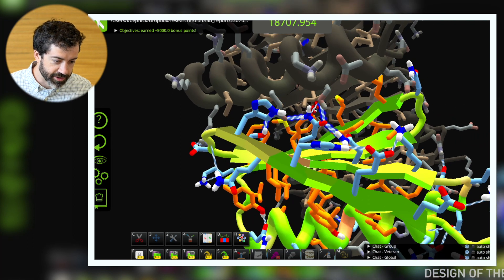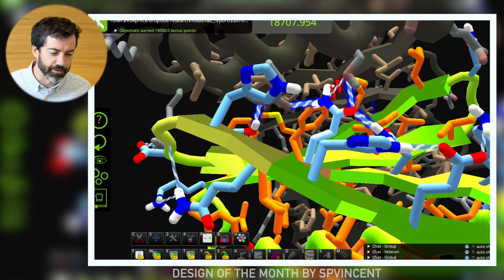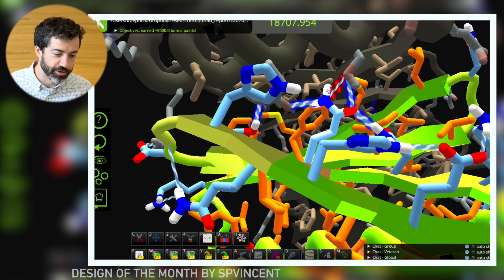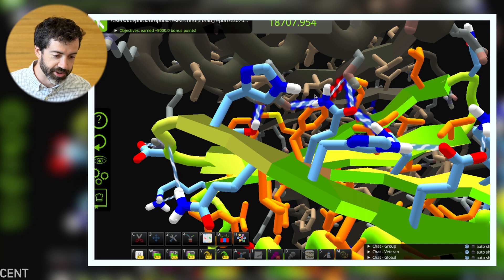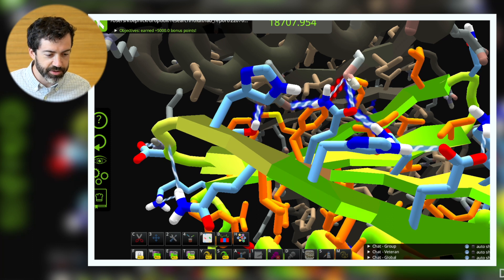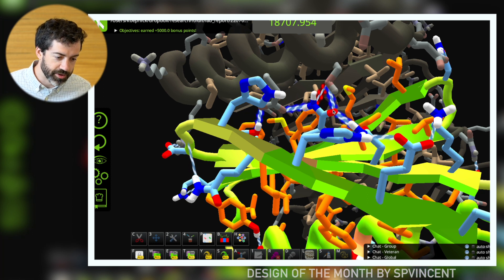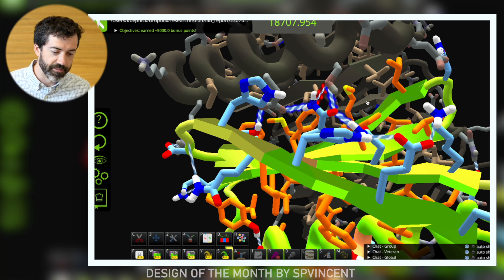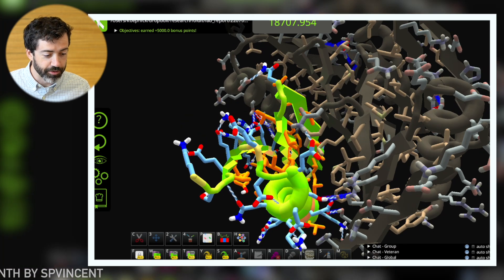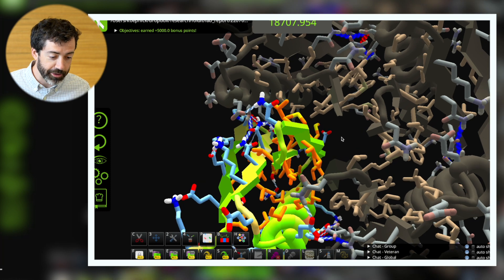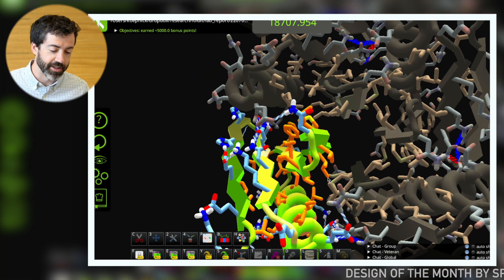This hydrogen bond network does have one red hydrogen bond, which indicates it is a weaker bond — the geometry is not ideal. Normally we like to see that the hydrogens point directly at the acceptor and the blue-white candy cane spirals come right down the axis where the hydrogen is pointing. This red hydrogen bond may or may not form, but that might be okay. This serine is well positioned to either donate a hydrogen bond or accept one from the neighboring nitrogen. Aside from that, I do like to see the nice balance of hydrophobic residues at the interface and hydrophilics — the hydrophobics are important for tight binding, since they like to be buried from solvent and will make tight binding interactions, causing these proteins to naturally want to come together so the orange hydrophobics are hidden.